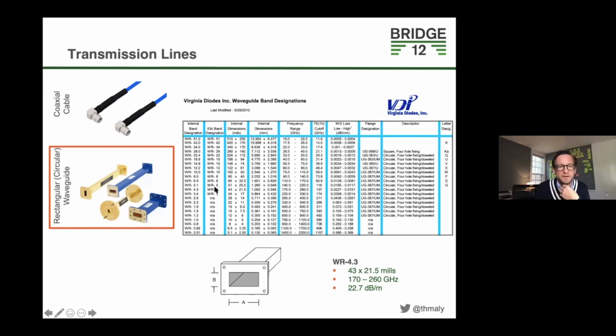However, the benefits of going to a smaller waveguide are not really that great or justified, so it's okay to stay with a slightly bigger waveguide here. However, if you look at the losses over here, this is 0.0227 dB per millimeter. So that's 22.7 dB per meter. So at these high frequencies, waveguide is not really a good option. This is maybe okay to plumb things around in your system, but you want to get out as soon as possible. If you want to cover distance, you need to get to a different means of transportation.